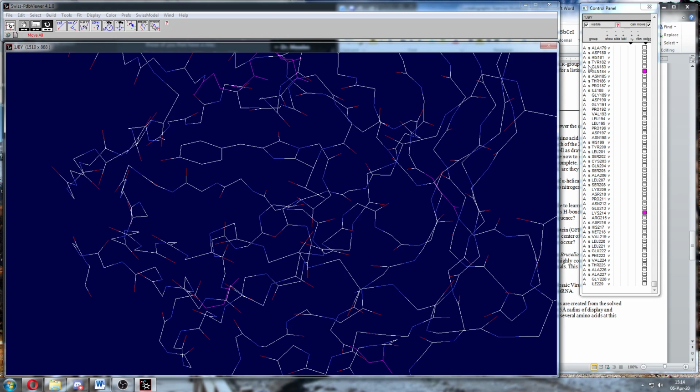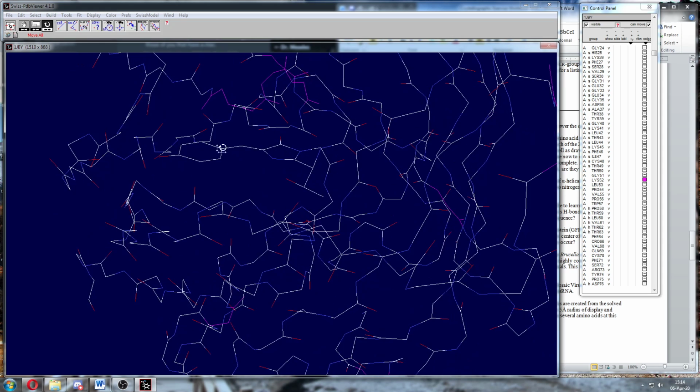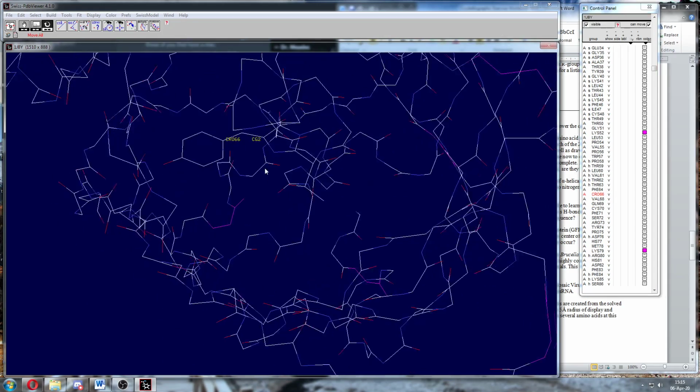So that ring right here is made from amino acids just prior to the tyrosine. And if you look in our list, the tyrosine over here is number, if I can find it, I think it's 66. Right, so tyrosine 66 on our list, which is right here, is listed as not tyrosine. It's been rearranged because the one right before it has been merged with it.